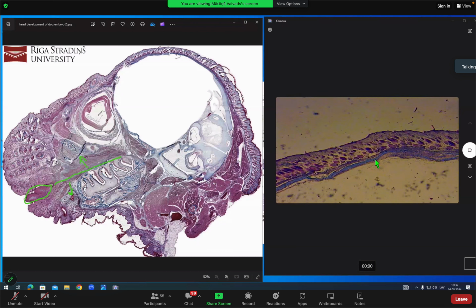But again, you have the eye development. You see the neck region with all the glands. Here, there's a small sublingual gland. Sublingual gland is here, so it's very small. Small fragments of submandibular gland, and brown adipose tissue. Brown adipose tissue in large quantities.